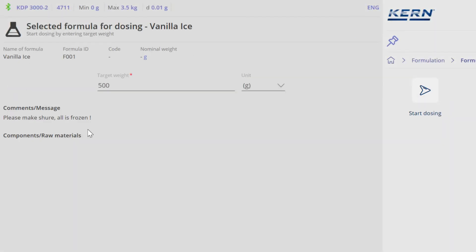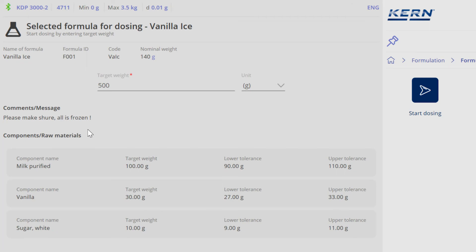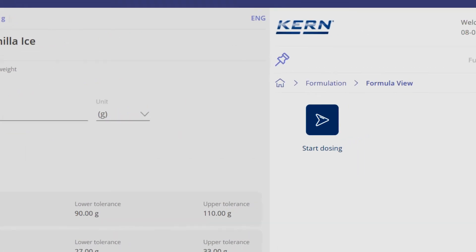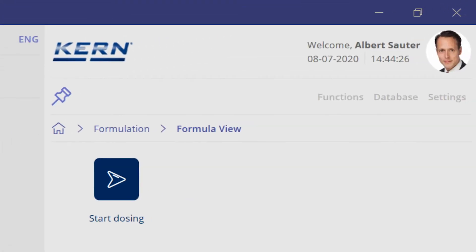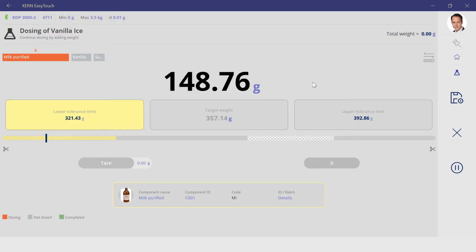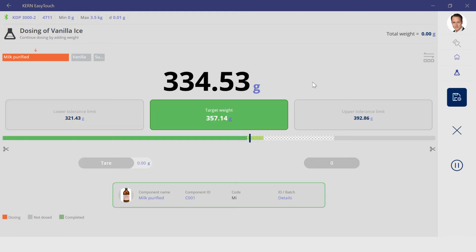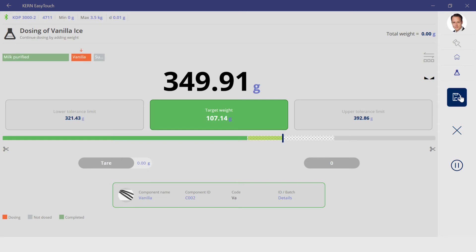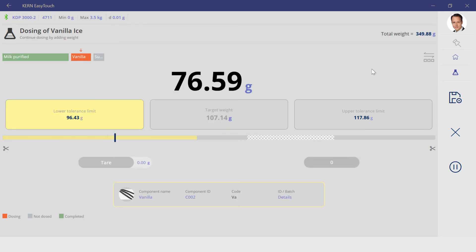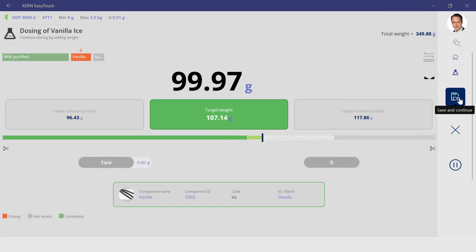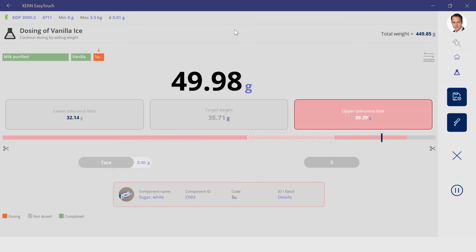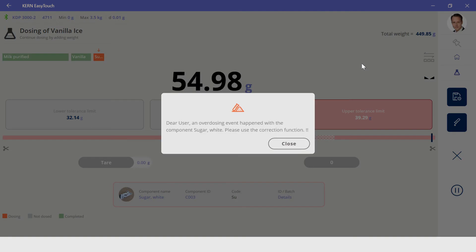Recipes can be created in Easy Touch and made unchangeable via defined access permissions. Normal users can use the recipe and are guided step by step through the recipe process, which largely eliminates errors. The dosing aid helps to achieve exact target quantities. The correction function can subsequently correct overfilling.